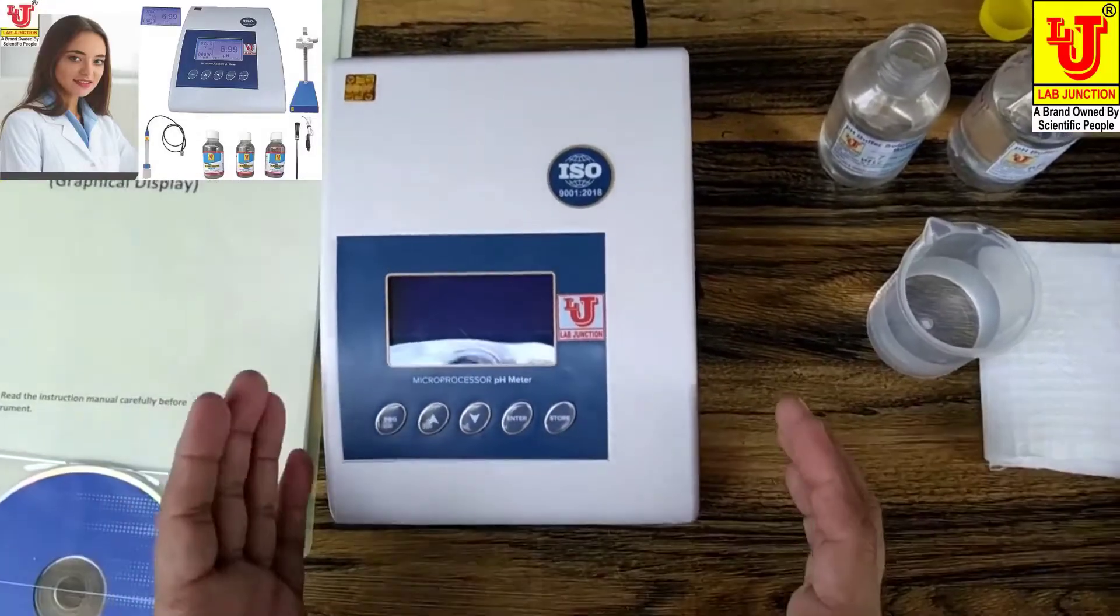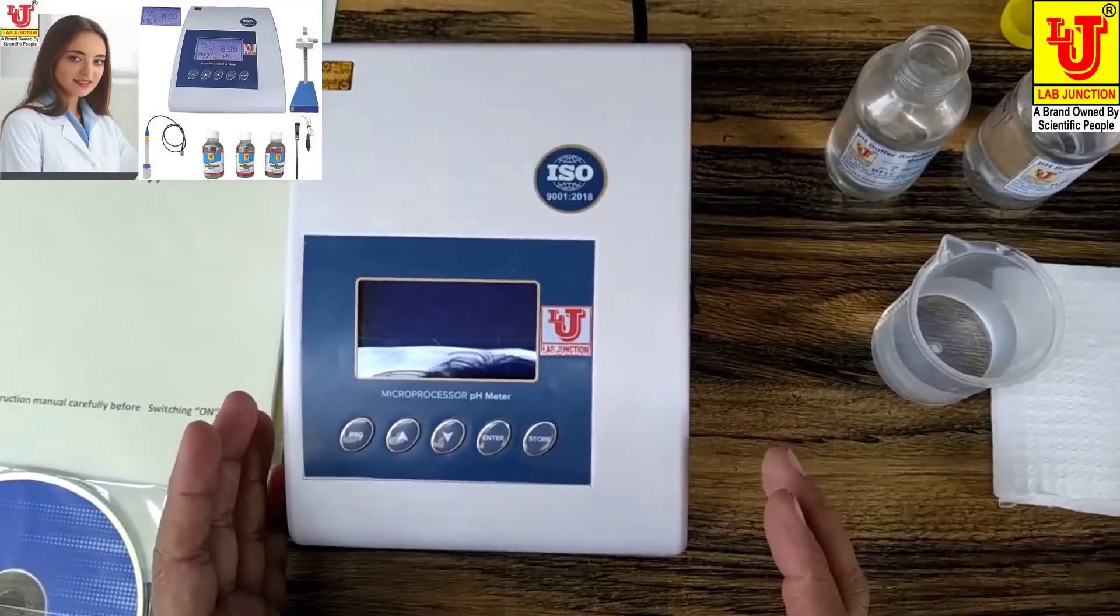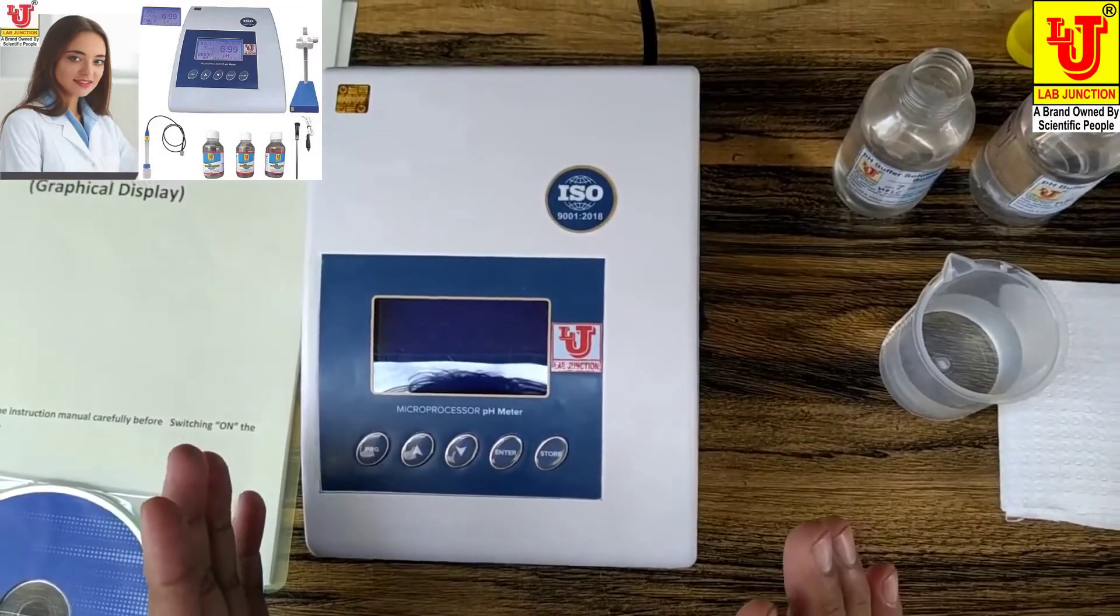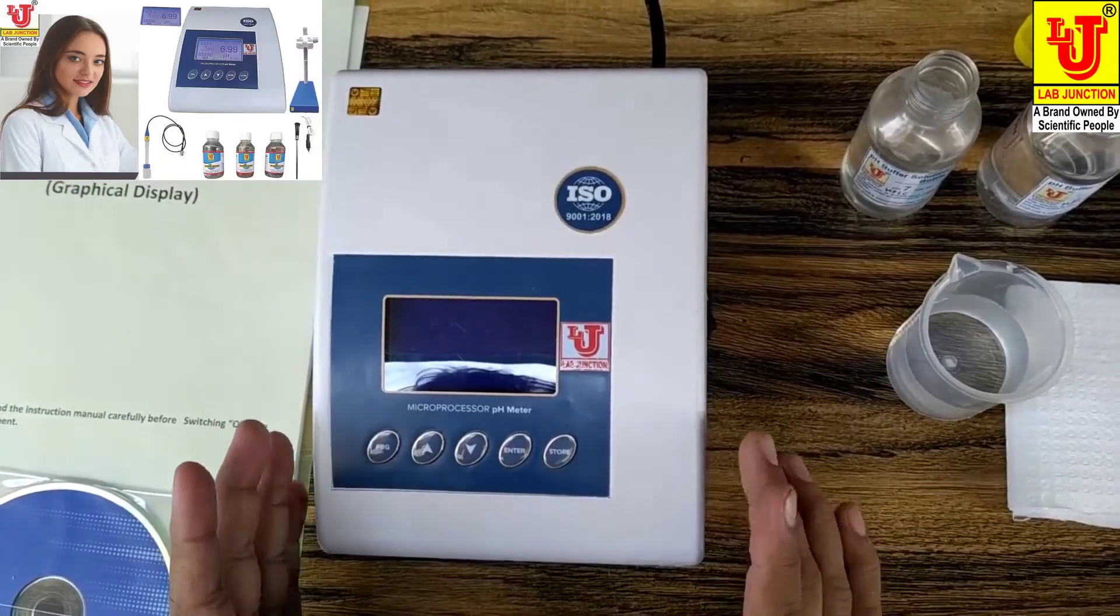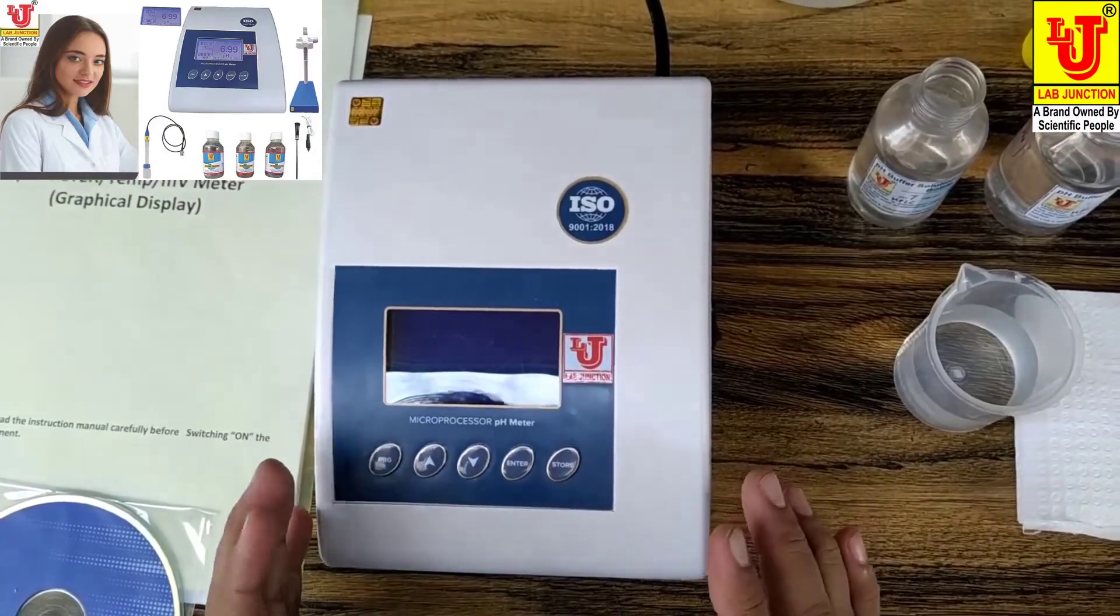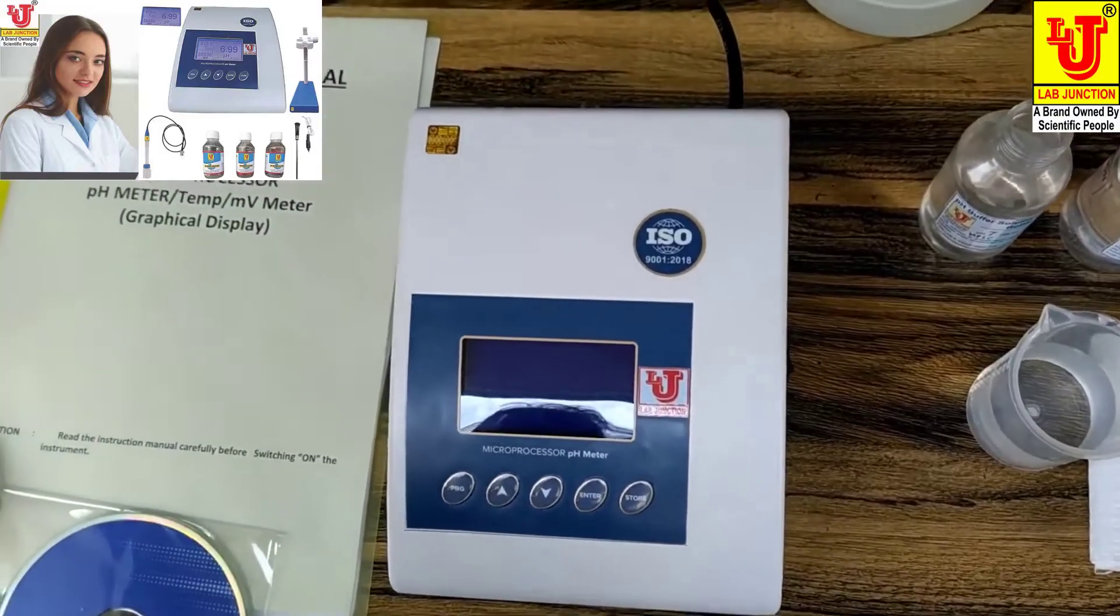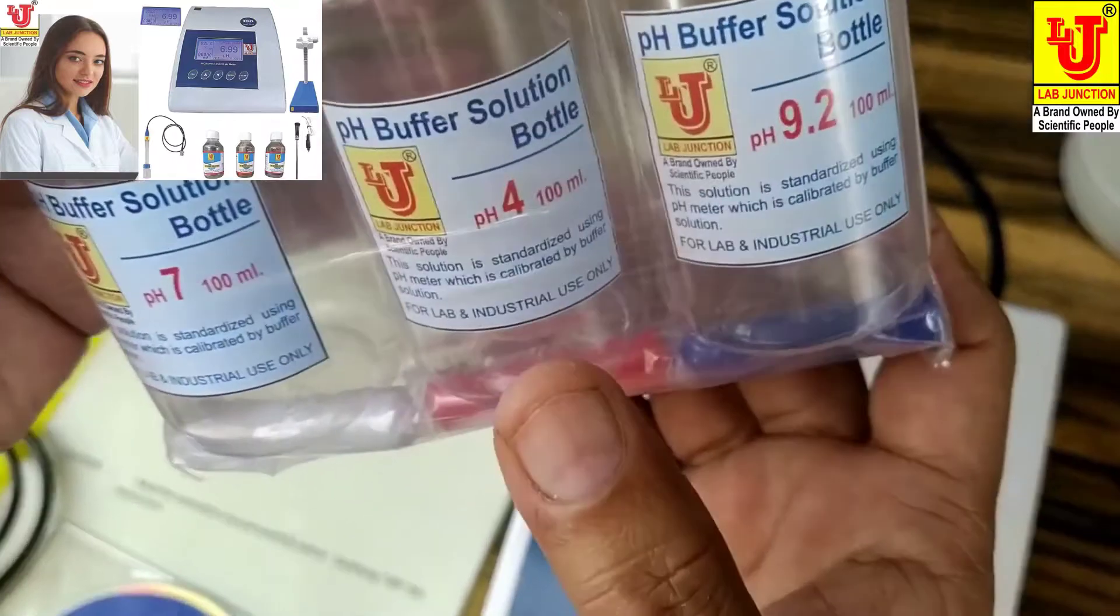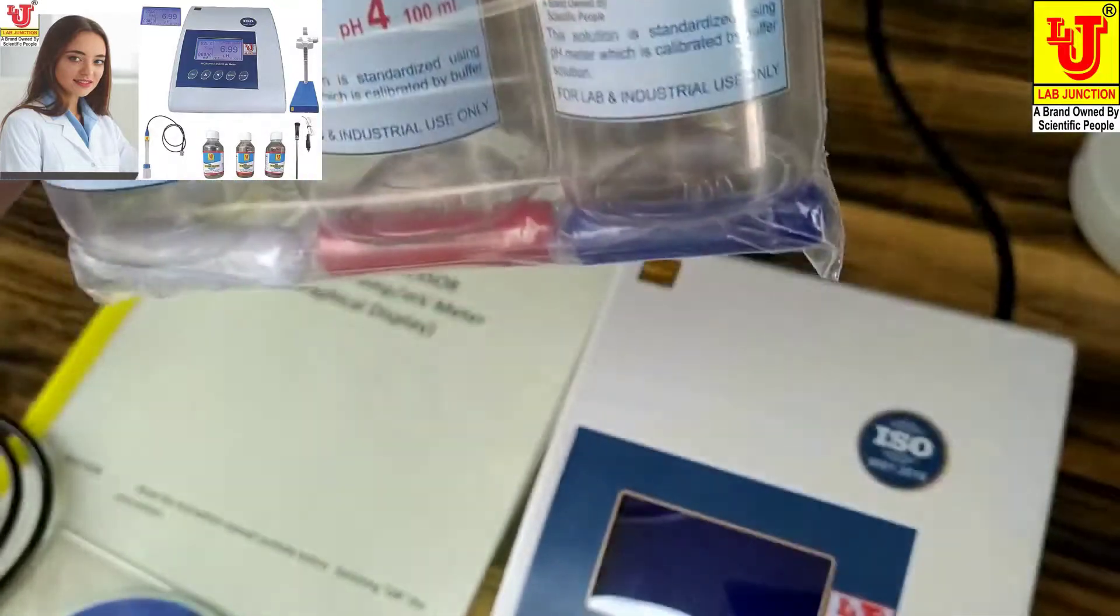Lab Junction's LJ1015 microprocessor pH meter. This pH meter includes accessories: three buffer bottles - 7 pH, 4 pH, and 9.2 pH.